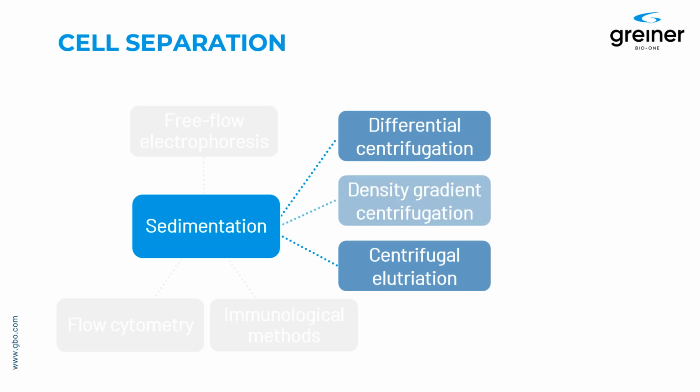Density gradient centrifugation combines the use of standard instrumentation with a method that provides both high resolution and good recoveries. First experiments were done in the 1950s with sucrose solutions for the separation of cell organelles and in the 1960s with cesium chloride gradients for DNA separation.